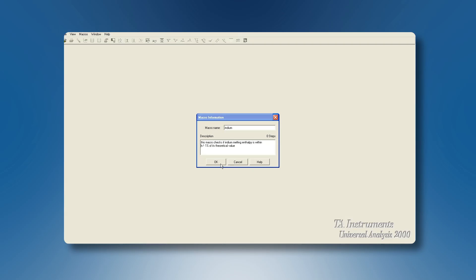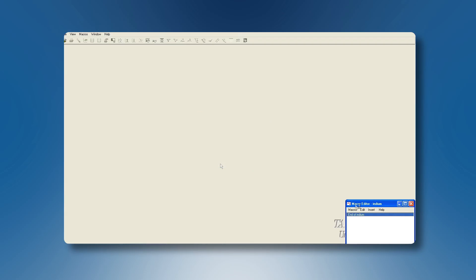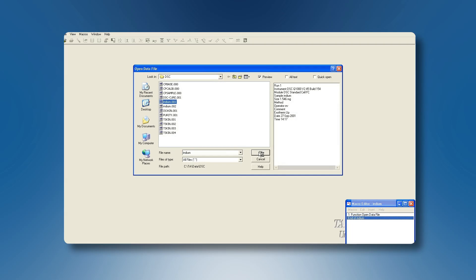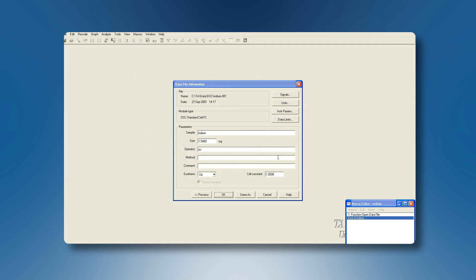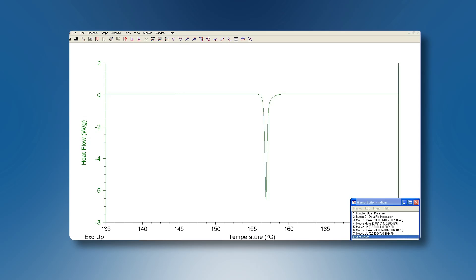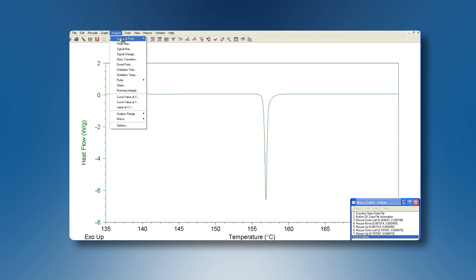The macro editor is opening now and will automatically capture all calculations that you are going to perform. Start opening an indium experiment. Rescale it. Integrate it using a linear baseline.